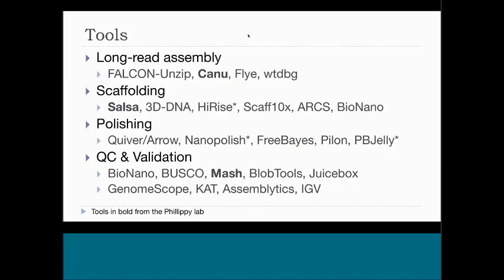So Hugh Robertson wrote in and said he just has a cautionary note in the new Aedes genome: they had quite a few false pseudogenes from low PacBio coverage and other problems, and those had to be fixed manually with the raw Illumina reads, and they only noticed those because of his detailed annotation of the large chemoreceptor families. So, as you said, it's still in those very odd areas, still having a lot of trouble, it sounds like.